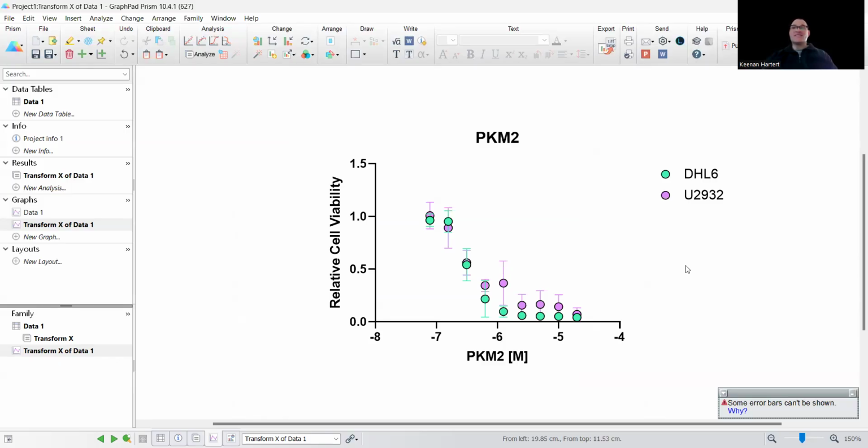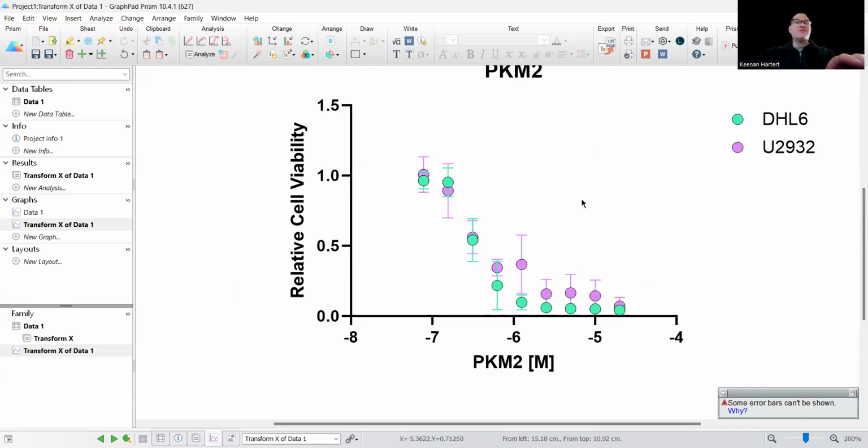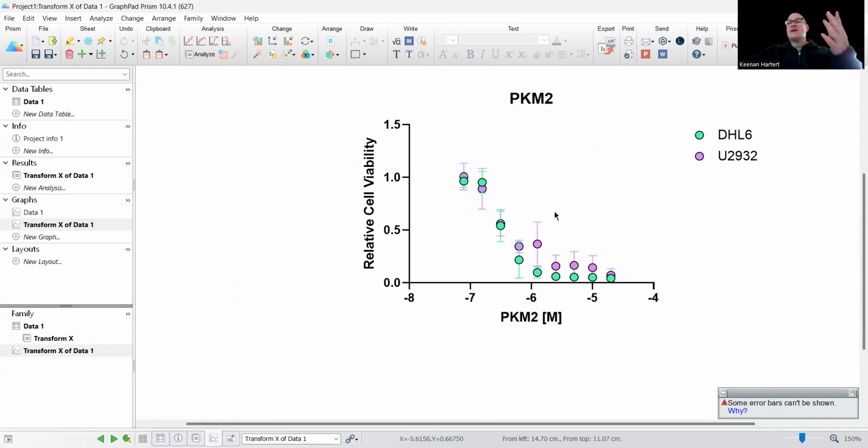So now you can visualize things a little better. It's doing really well with our error bar. You can see where there's dose separations. You can see certain treatments that were a little fussier, for example, that you may want to look into. But again, across 9 treatments, not bad, with 9 replicates in each in some cases.